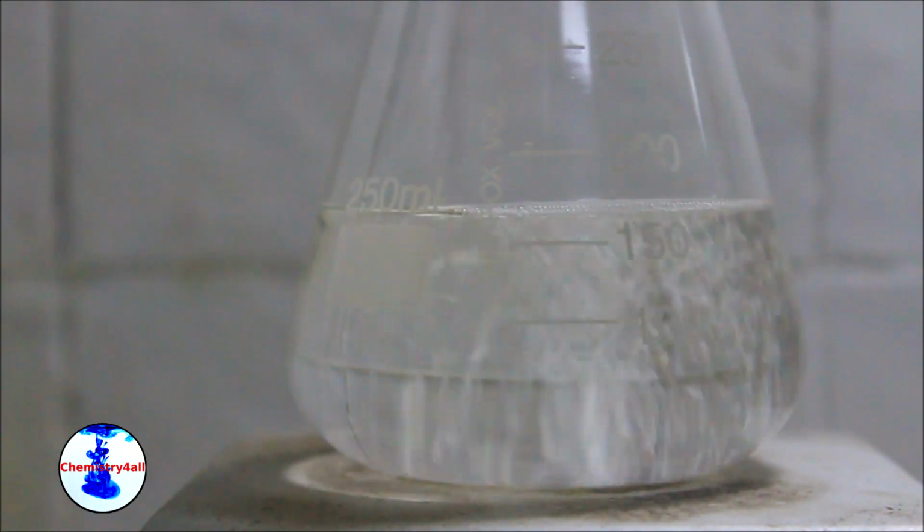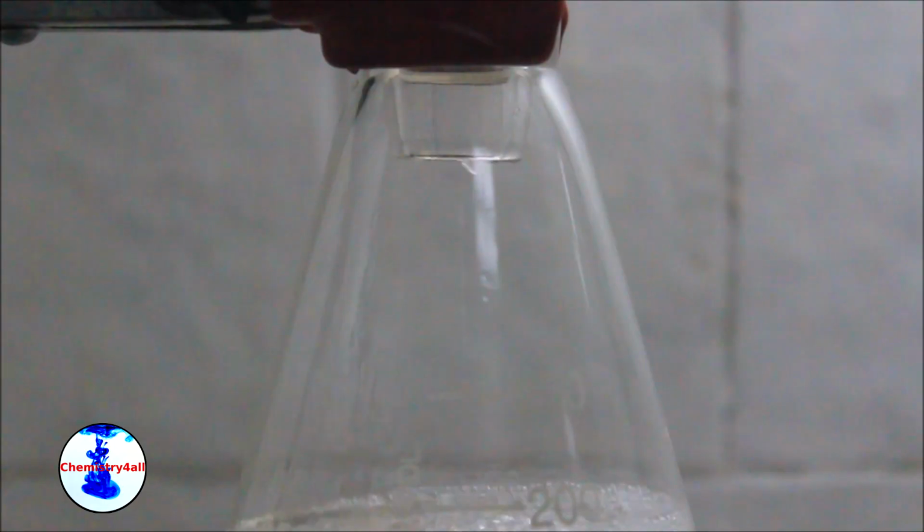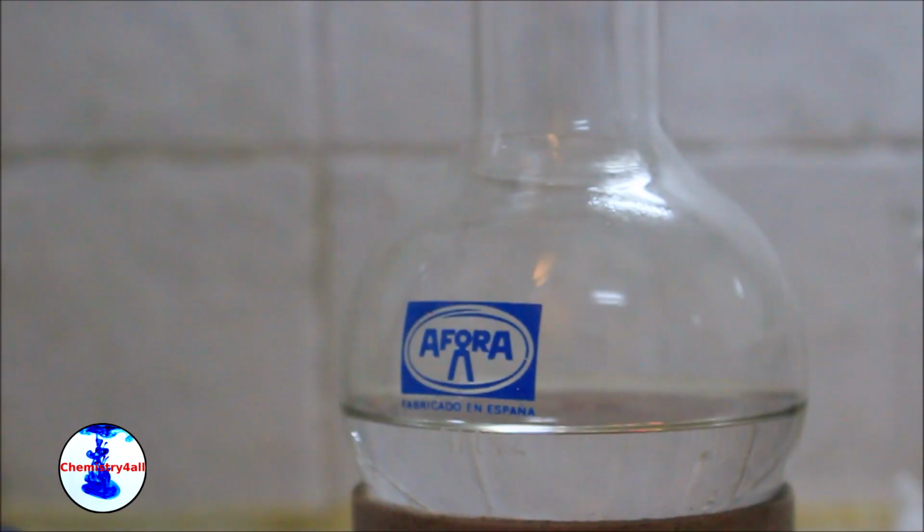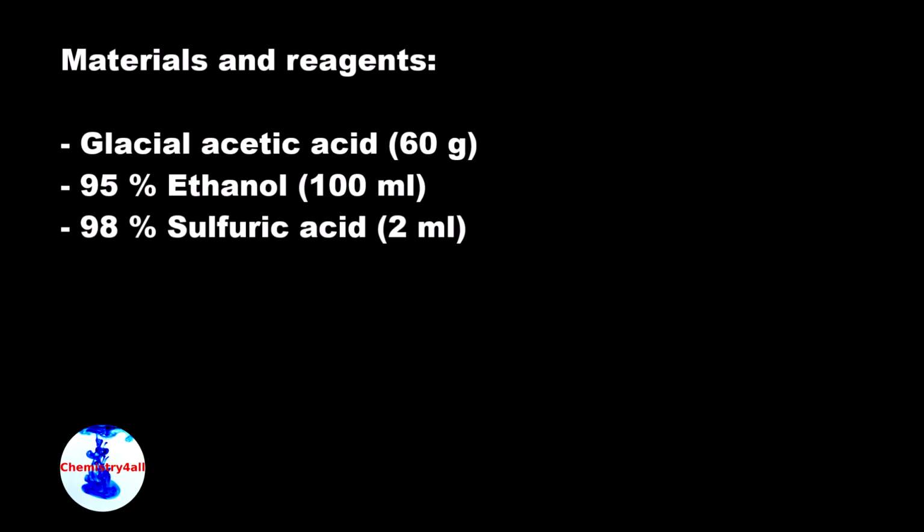Today we will be making some ethyl acetate, starting from acetic acid and ethanol, by means of a classic Fischer esterification reaction. For this experiment, we will be using 60 grams of glacial acetic acid, 100 ml of 95% ethanol, and 2 ml of concentrated sulfuric acid.